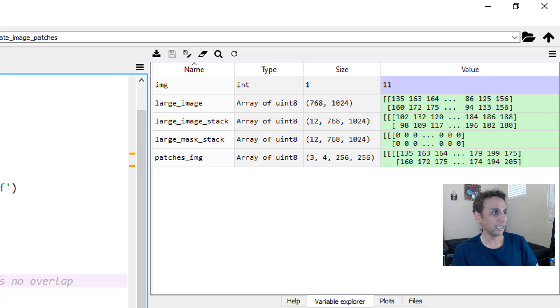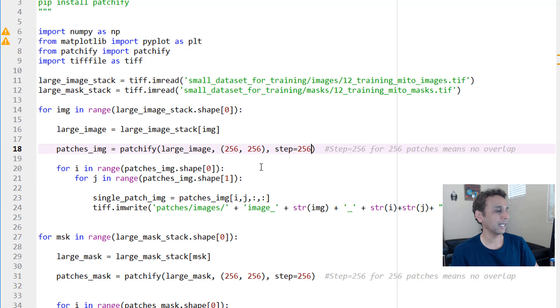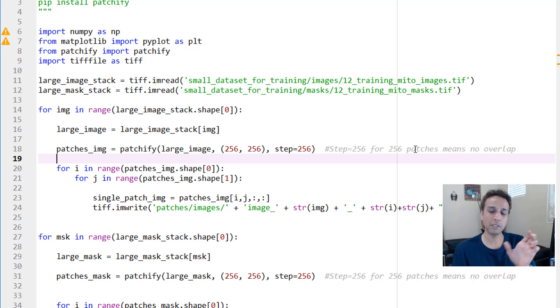If I change this to step size of 128, then this would be—let's only run these lines—then we should see a few more. Now you see 5 by 7 because there is an overlap, not just 3 by 4. I hope you got the point here. So let's go ahead and continue 256. Let me go back.